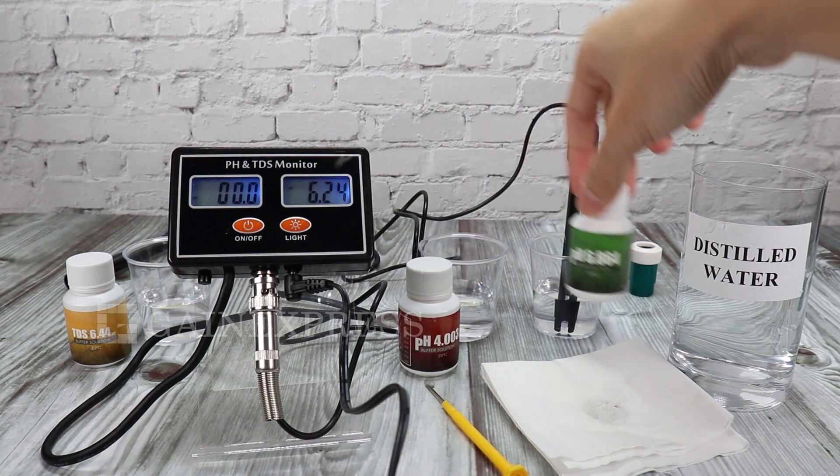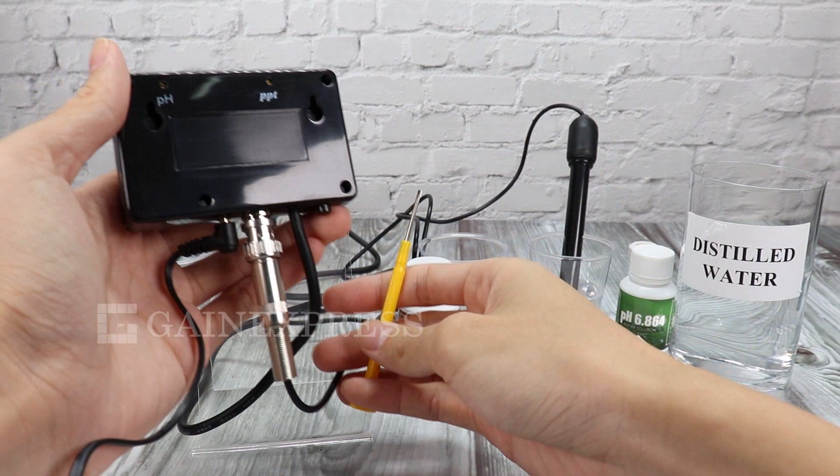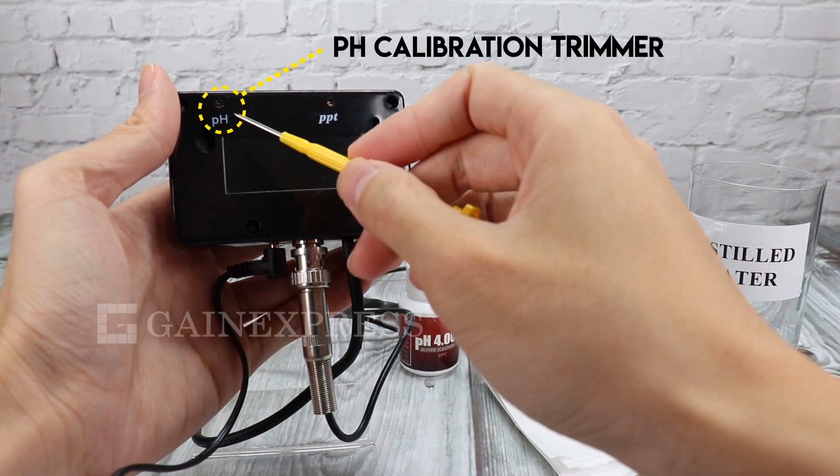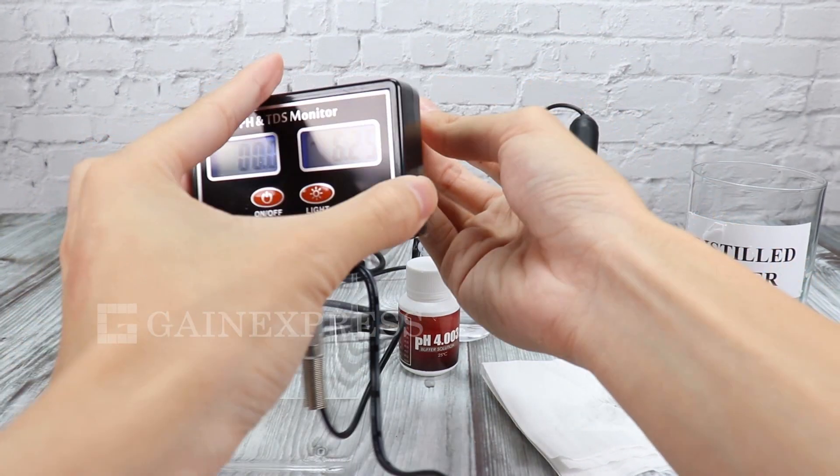If the value on the display is not the same value as 6.86, gently turn the pH calibration trimmer at the back using the mini screwdriver provided in the set, until 6.86 shows on the display.